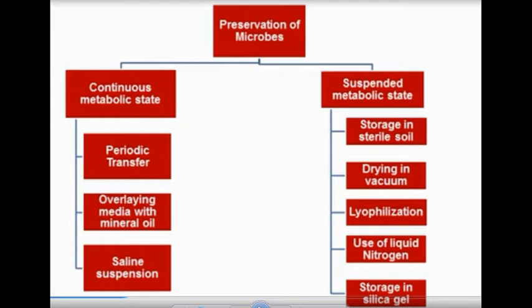Using saline suspensions is a method which is mostly preferred for transferring the cultures from one place to another, where the metabolic activity of the organism will not be undergone. Only the moisture conditions will be maintained in order to maintain the organism in its normal state.